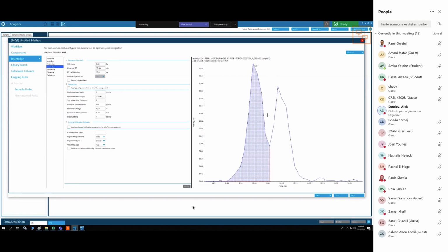So I have the retention time, and I made the baseline subtraction window with the peak, and then I decrease the peak splitting factor in order to split. And I'll do the same thing for terbutryn, but I'll focus on getting this. I don't know if it's correct. No way to know. Just a guess, and we'll go and check in the data together, and we'll decide which one is right.